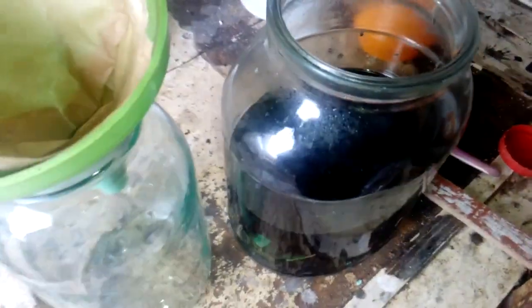The reaction is done. If you see that inside the jar there is no gold on the finger anymore — no more reaction, no more nothing. So what we're going to do next is filter this, clean the finger, and drop some gold.